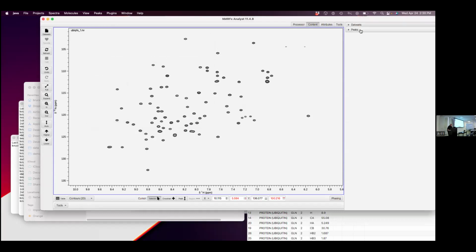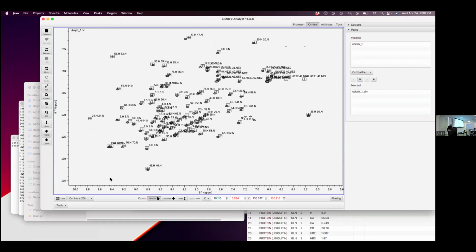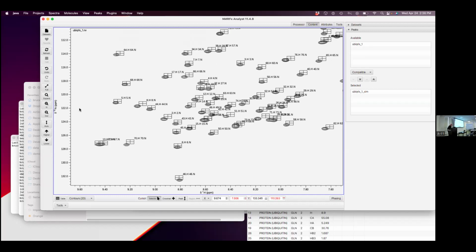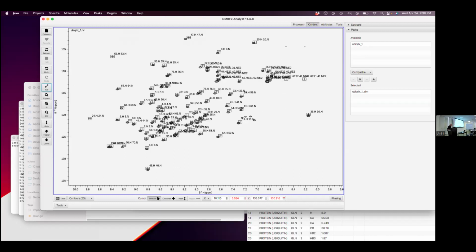And we can now go to peaks over here and say, I want to put that simulated list on the data. So you can see there's a little reference difference, but things are pretty close. This is not collected under our exact same conditions. Maybe center based on just repeatedly centering. Yeah, from the existing. Yeah.